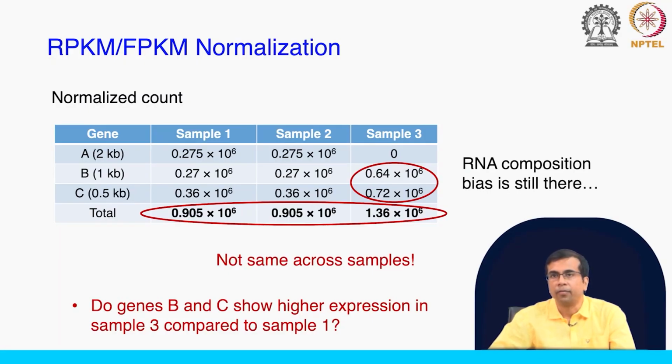What you would notice now is that the total is actually not the same for all samples, and this has changed. This is a problem. Again we are comparing a different total number of reads, or total sequencing depth. This is a transformed depth, of course, transformed with all those divisions. But again if you look at the total, this is different.